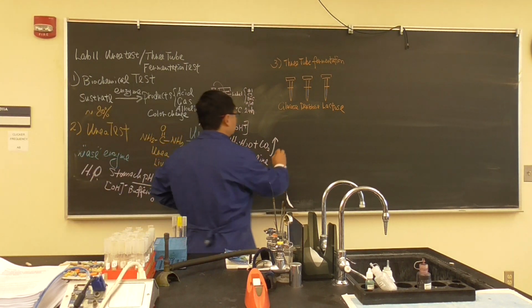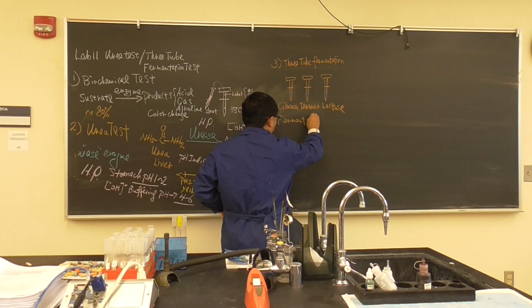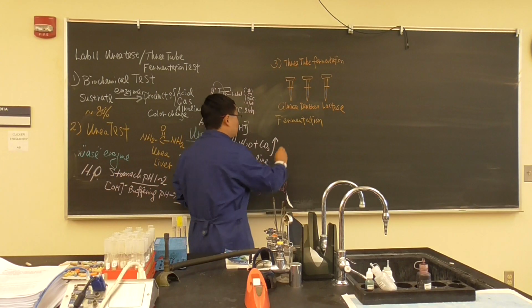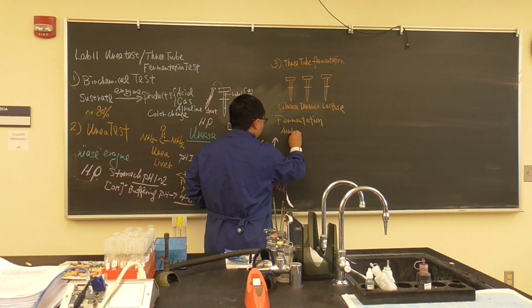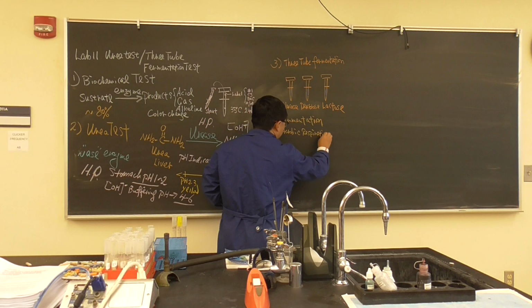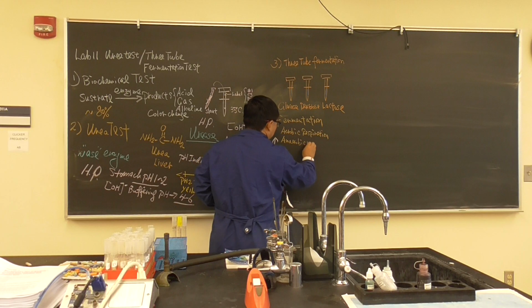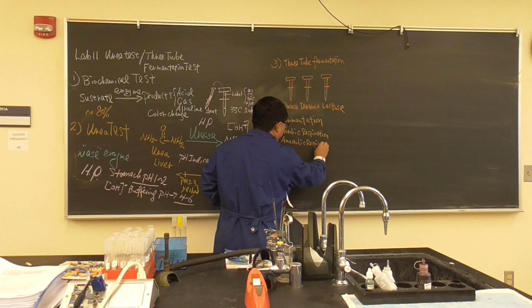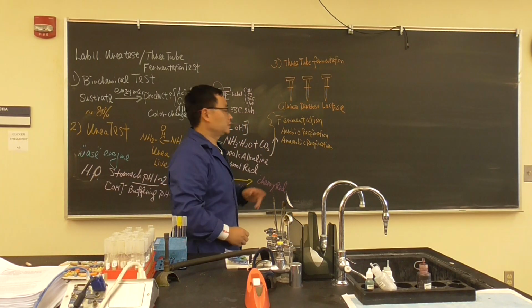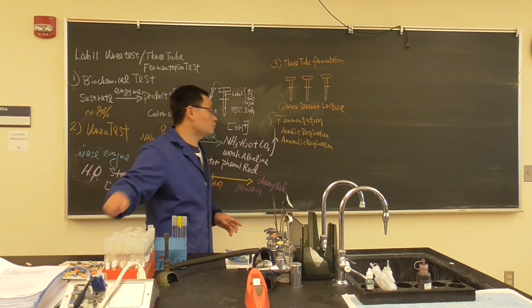What is fermentation? We talk about bacteria. During the metabolic process, there is aerobic respiration, and there is anaerobic respiration, and then we come out with another one called fermentation. They are related to the electron transport, which we'll talk about in the lecture. So fermentation, what will we generate?